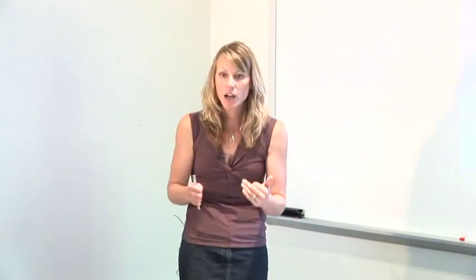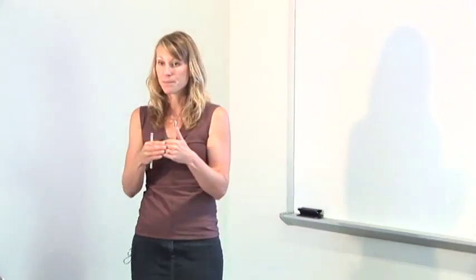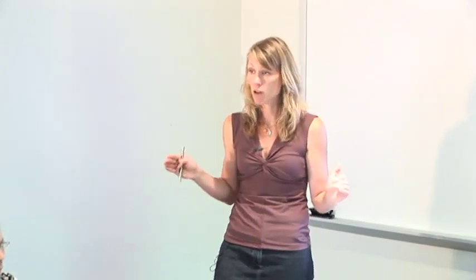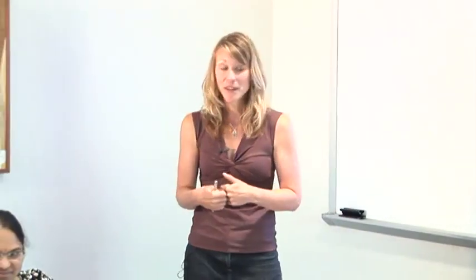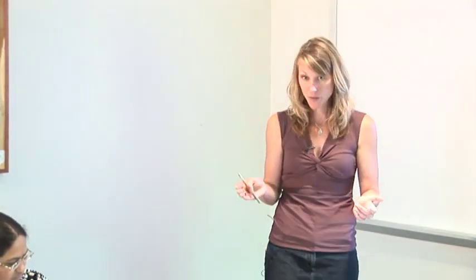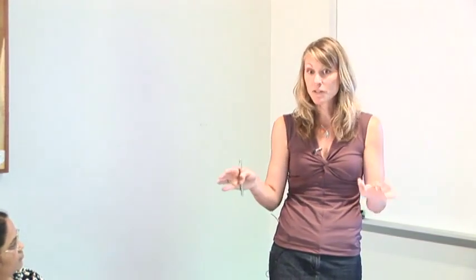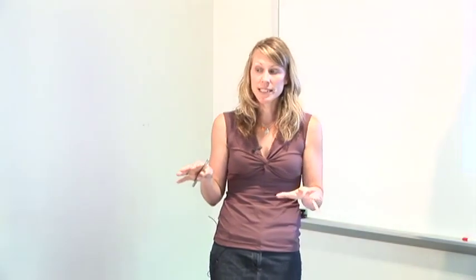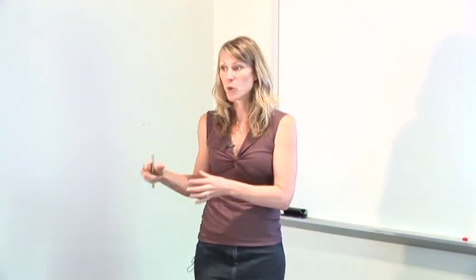So everything that I've talked about right now is very general. Okay, so in general, all of the database search algorithms work this way. But there are many, many different software packages out there, and probably all of you are going to have access to different ones. And they all are going to work a little bit differently, mostly in the way that they score the results.